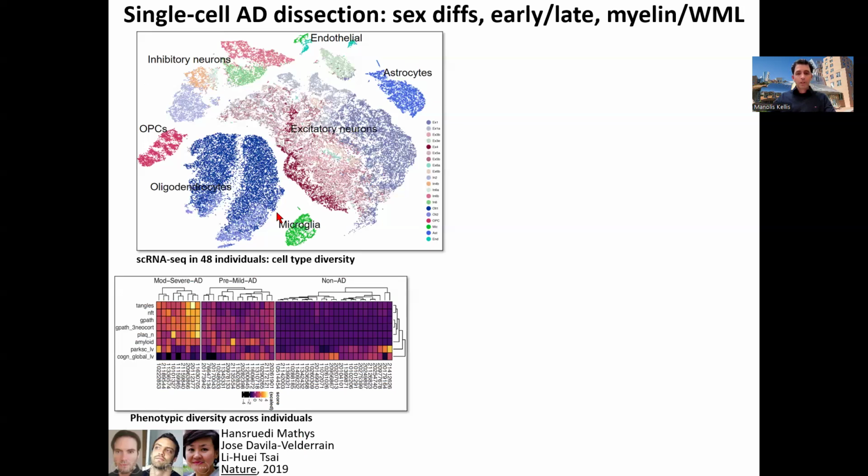And what we basically looked at is, what does this all mean? What are all these cells doing? Okay, so I'm going to show you a lot of the computational steps to figure this out. But very briefly, the first step is to clean up the data. And I'm going to tell you some stuff about that. What does clean up the data mean? That basically means find metrics of quality that allow you to throw away individual cells, or throw away a whole experiment, or throw away individual genes that might be misbehaving, and so on and so forth.